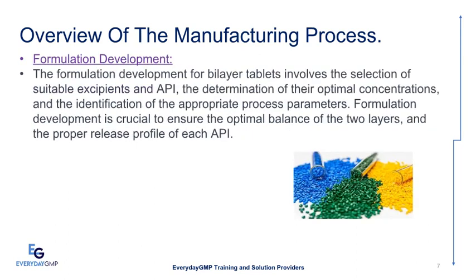Continuing towards the second step of the overview of the manufacturing process is formulation development. The formulation development for bilayer tablets involves the selection of suitable excipients and API, the determination of their optimal concentrations, and the identification of the appropriate process parameters.